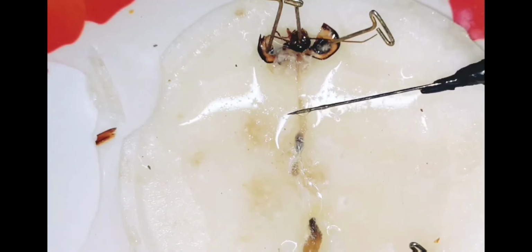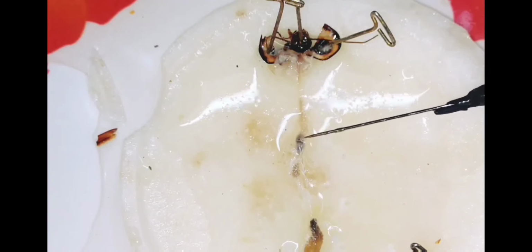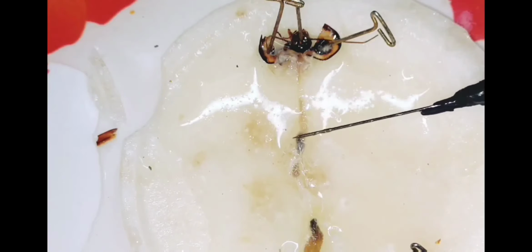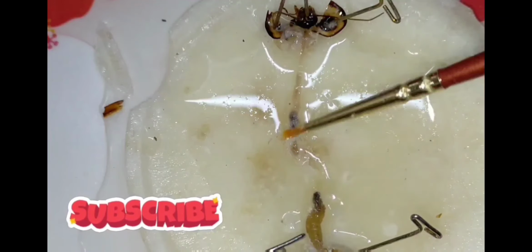At the end of the crop, there exists the gizzard. You can see this is the crop part, and at the end you can see the gizzard. After the gizzard, you can see the hepatic caeca. You can observe this white color. This is the hepatic caeca, whose number is 6 to 8. Hepatic caeca are present in the cockroach.